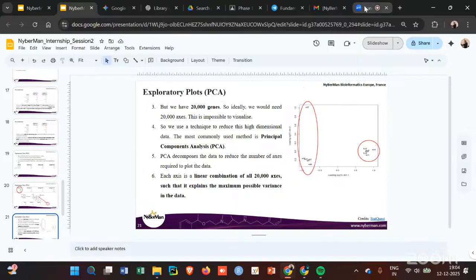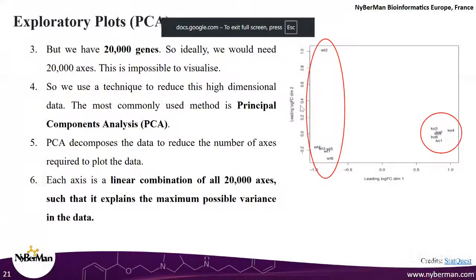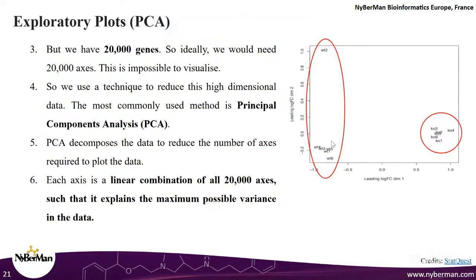Does that make sense? Practically, how many plots can we do for these PCs? So ideally, what we end up doing is we do a plot between PC1 versus PC2. We can also do PC1 versus PC3, PC2 versus PC3, or we can also simply do a 3-dimensional plot, PC1 versus PC2 versus a third axis, PC3. And we basically plot each of the samples on the plot. Okay. So three PCs are the maximum possible, like PC1, 2 and 3?